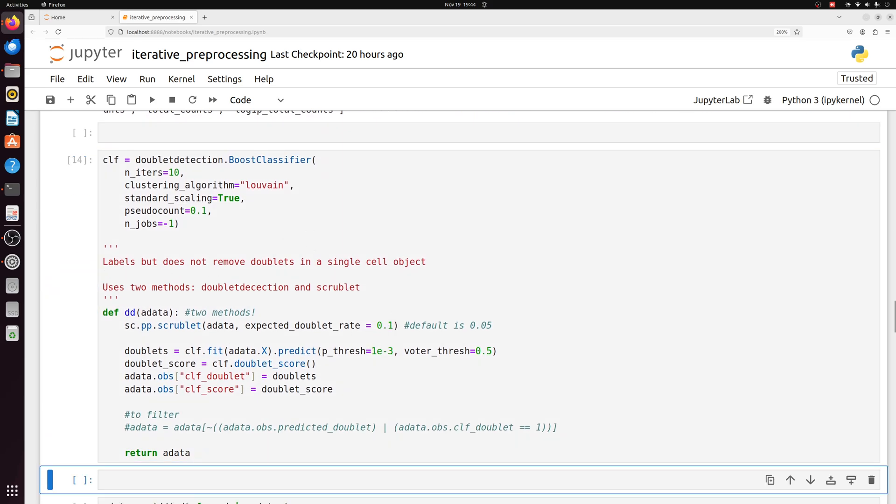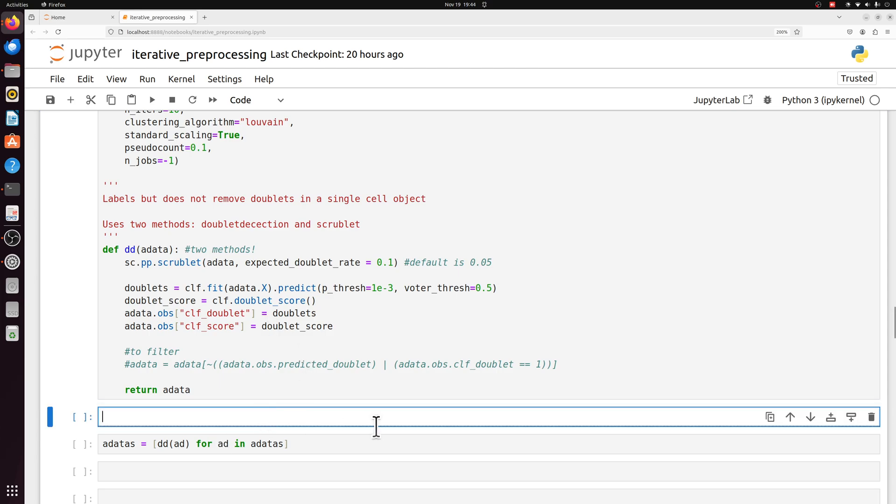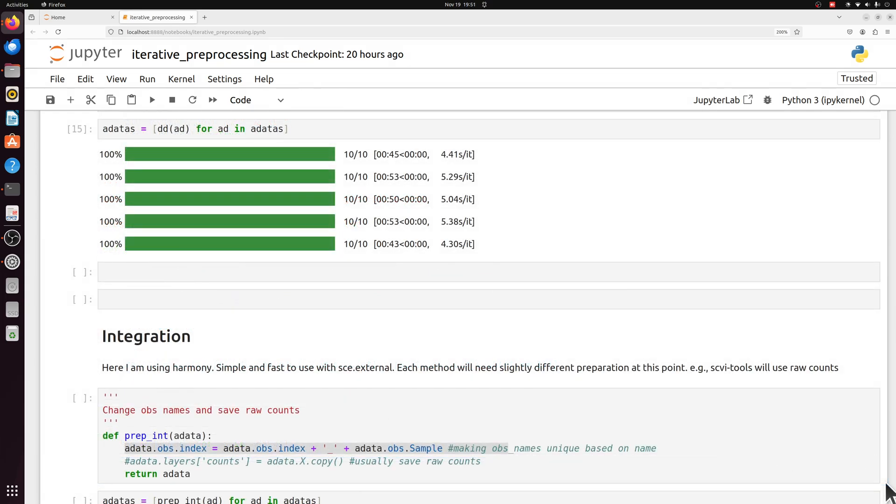And then we're going to use two different doublet detection methods, just because I find that doublet detection methods actually vary a lot. So I like to confirm the results with two different methods, at least. So this will take probably a minute or two per sample.